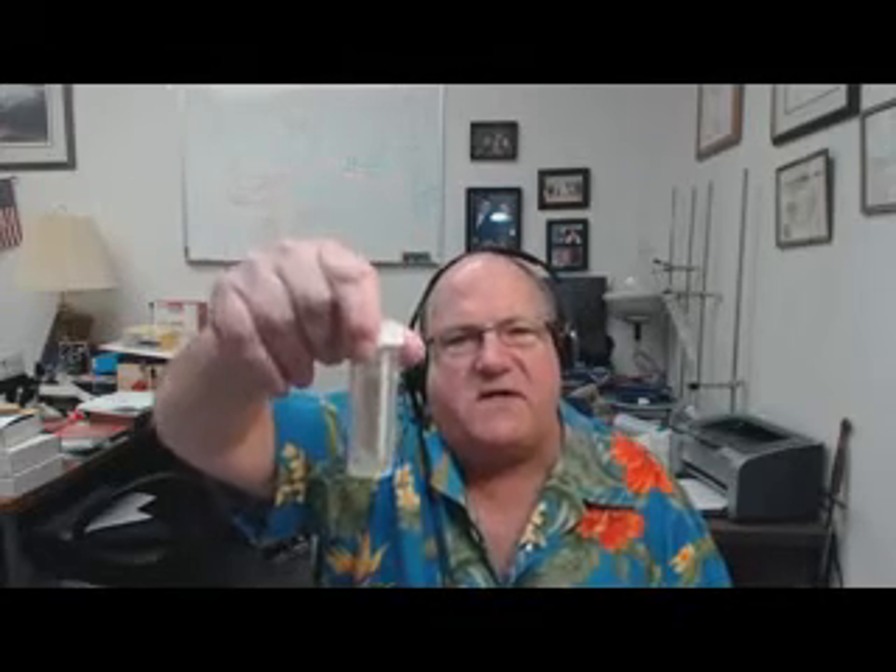We also have this — a bacteria and fungus test kit. You unscrew it, don't touch it, dip it in the coolant, pull it out, set it here. Put it on a shelf for two, three, four days out of direct sunlight. Then you count the little dots that grow on it.